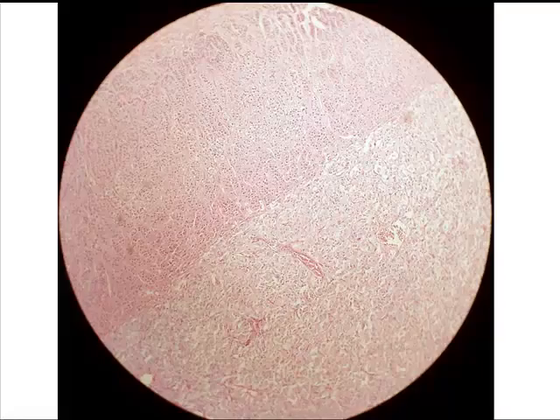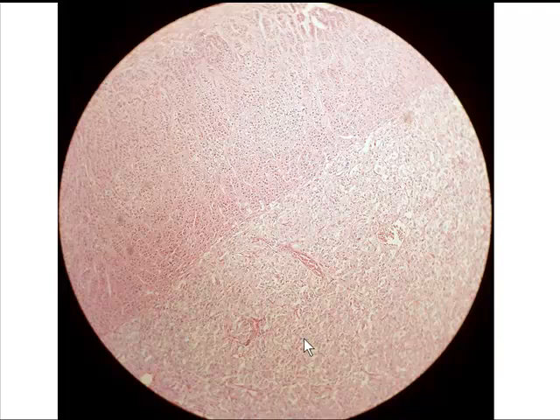This is the second of the 4 slides that you need to know for endocrine system. This is the adrenal gland seen at low power magnification. And with the adrenal gland, technically you can actually see both medulla, as we see in the lower right, and cortex in the upper left. And that's the level that you'll need to know. But in fact, you can see 3 different zones within the cortex as well. We won't require that, but you'll know when you look through the book that there are 3 different zones, and you could see that in the microscope. But we'll only require adrenal cortex and medulla.